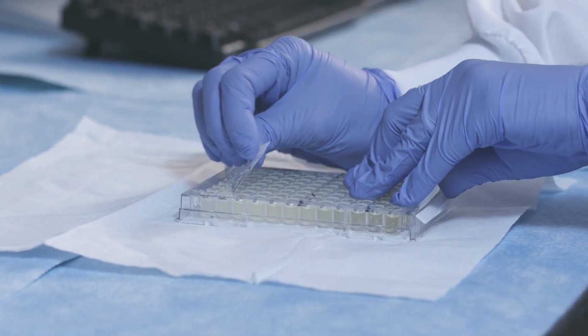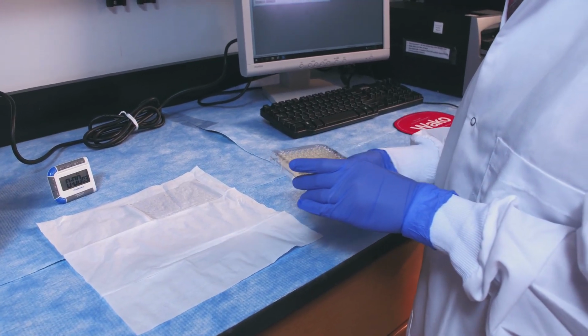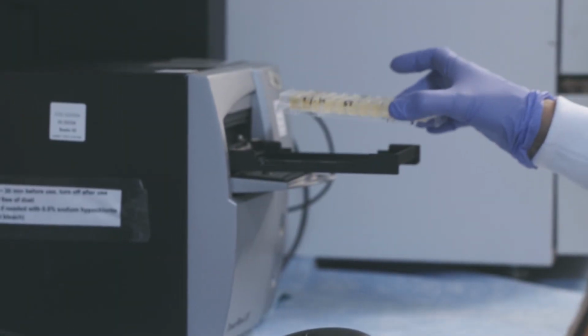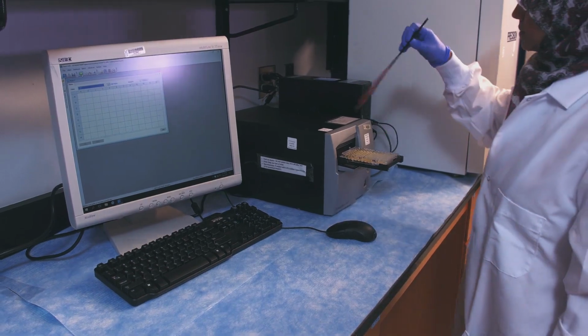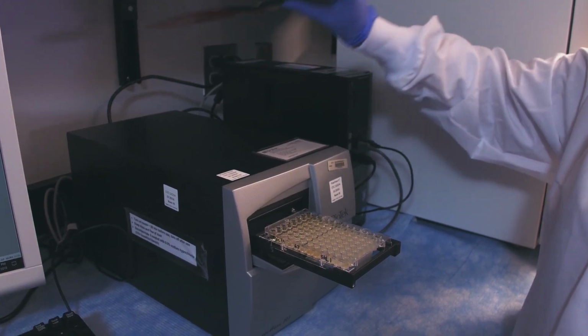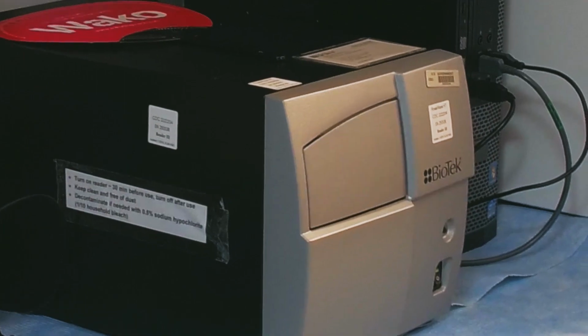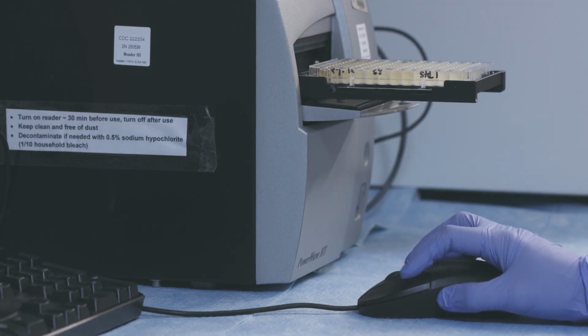During this minute, open the sealing membrane, wipe the plate bottom with a tissue in case there are any particles or dust, and place the plate into the plate reader. To remove any microbubbles inside the wells, gently fan the air above the plate and check for any floating particles inside the wells. Read the plates one by one in exactly the same way. Save the results after each plate reading.